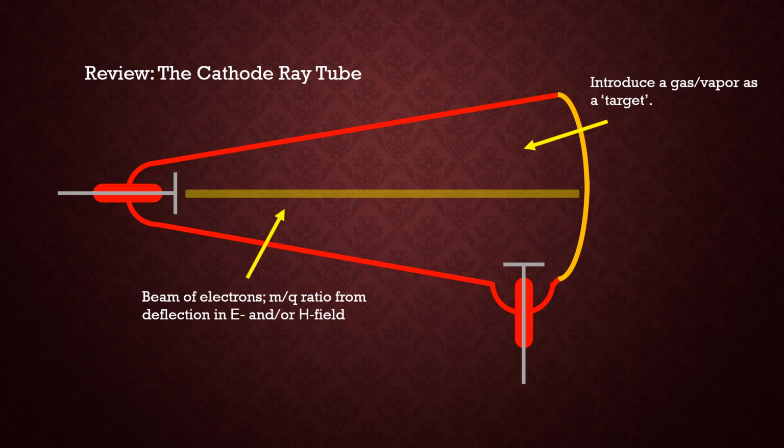If one puts into the path of the electrons a vapor, a gas, or atomic vapor, they become targets of the electrons, and they can become ionized as the ballistic electron collides with the neutral atom and knocks an electron off the neutral atom or molecule.